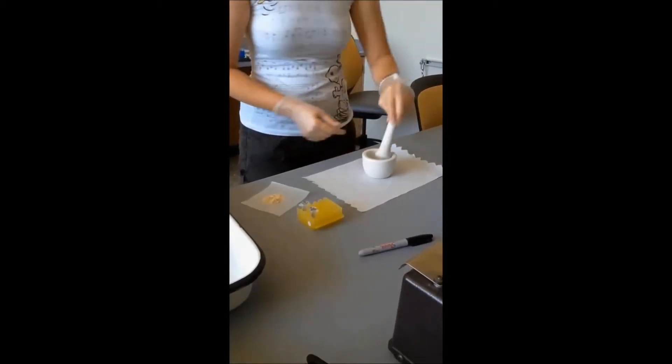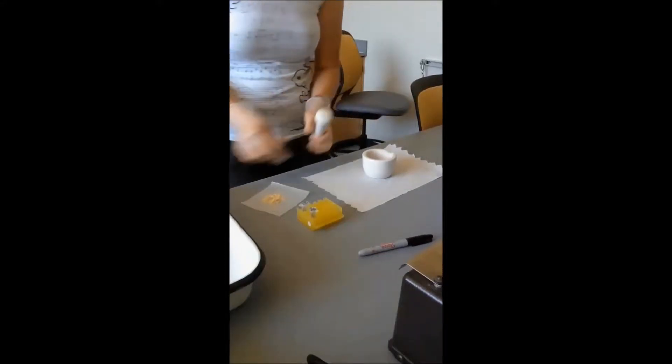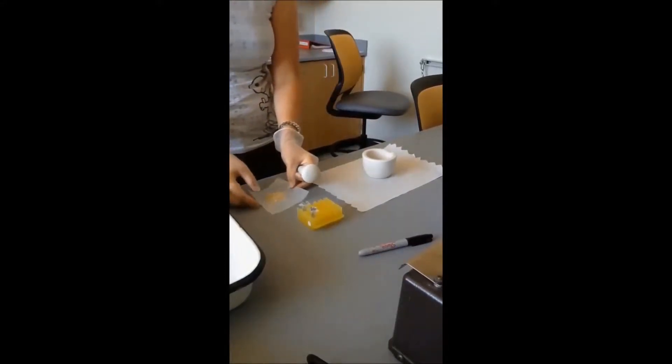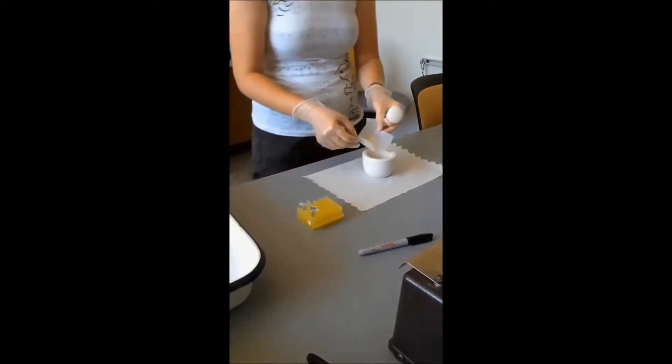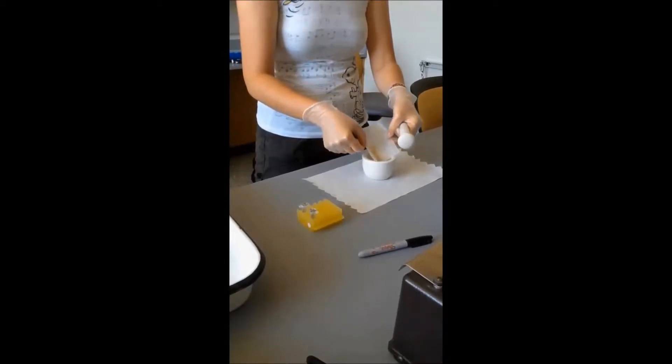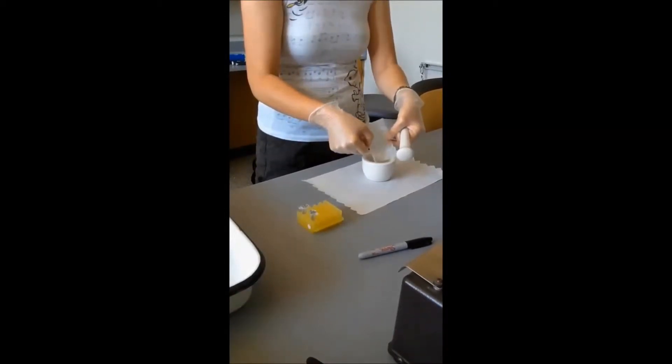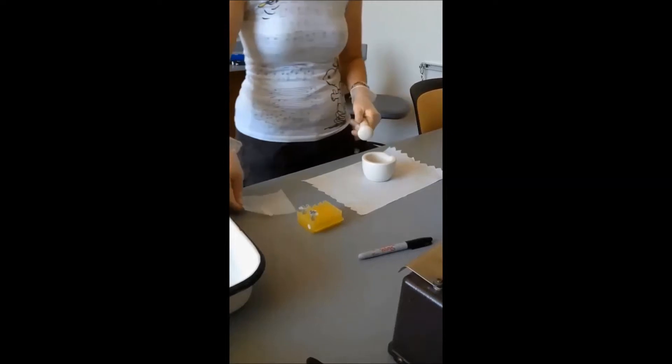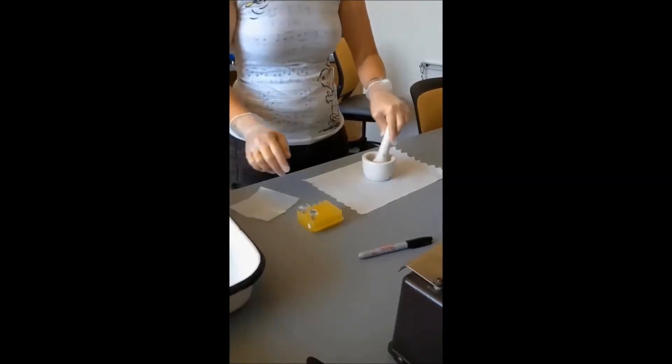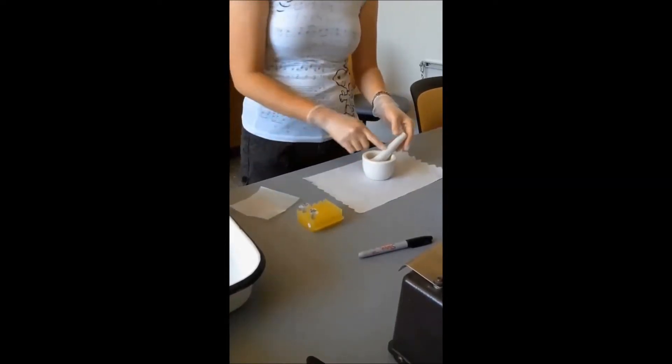So what we're going to do is we're going to take our whey paper that we had folded before we added the sample to it and just pour it carefully into our mortar and pestle. I'll put the pestle back into the mortar.